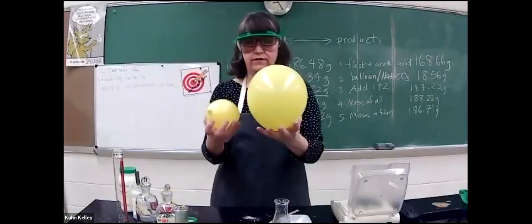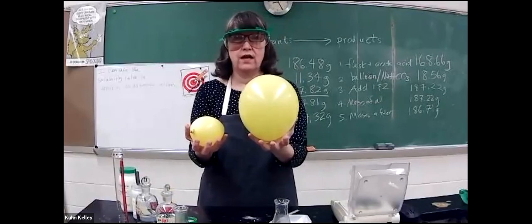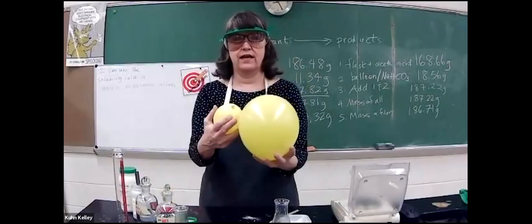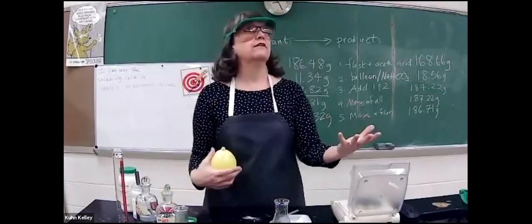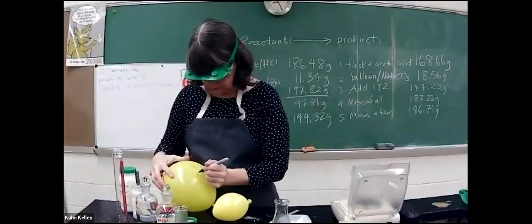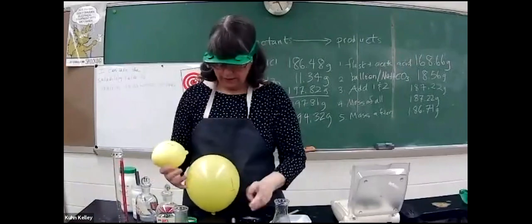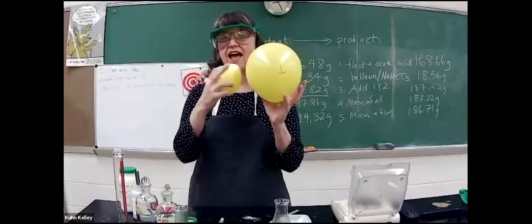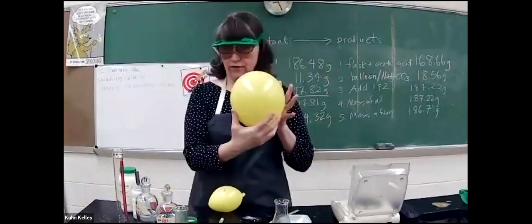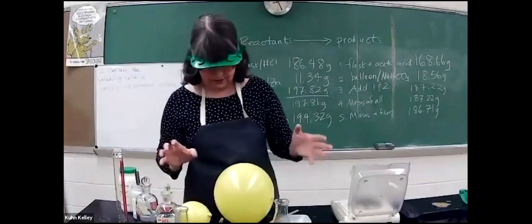So one thing I'd like you to observe is if I toss these both up, and instead of using my hands to toss, I'm going to use my knees to give them both about the same amount of push up. Look at the difference in the balloons as I send them up. So this was the balloon from part one. And this was the balloon from part two. What other observation can you make about maybe the heaviness of these gases? This one is actually quite light. It does not float up on its own, but it does go up. This one comparatively is pretty heavy. So I'll set those there, if that will stay there.